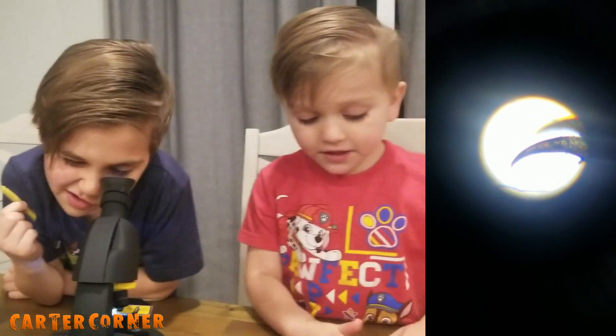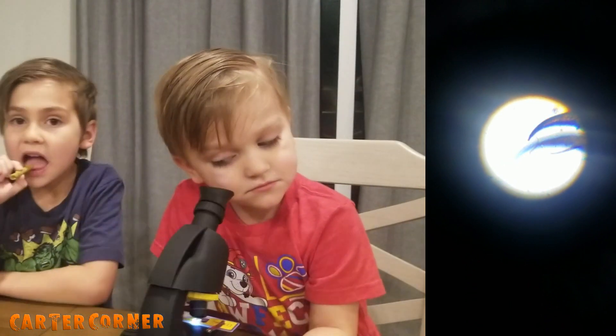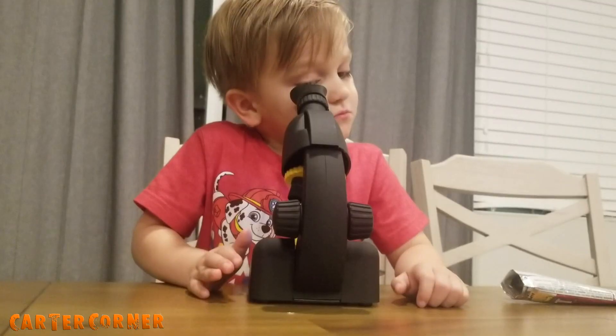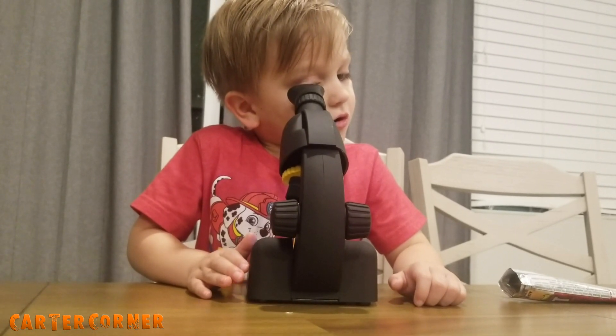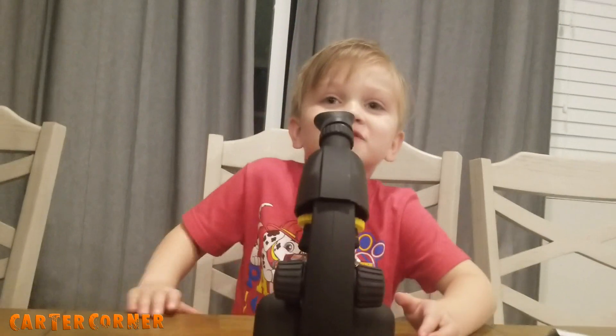That's the very end of the cricket's leg — that's how they're able to grip and climb, because they have little hooks. What does that look like, Preston? It looks like grass.